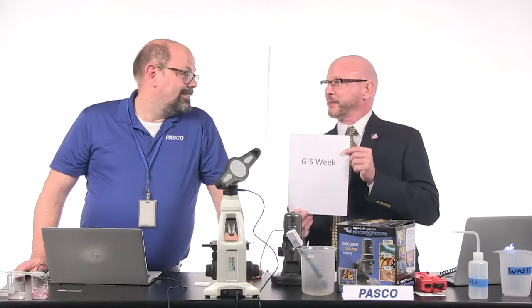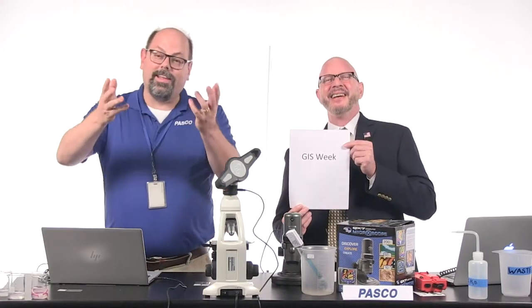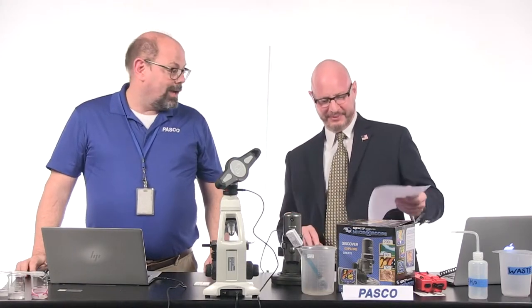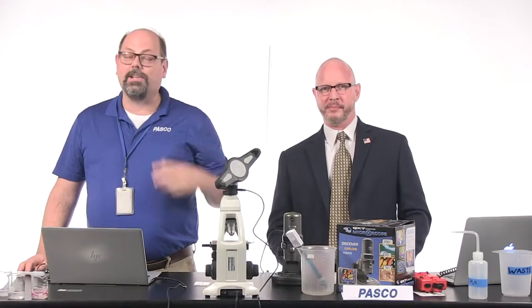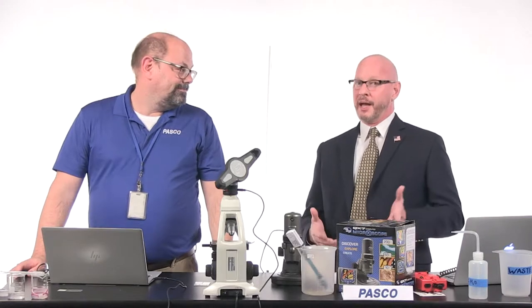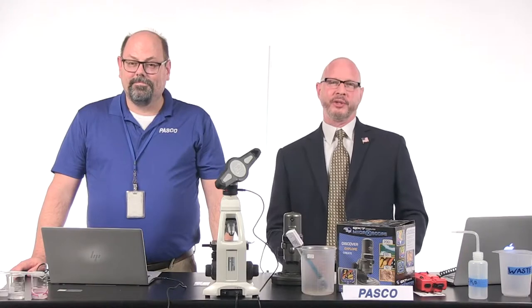I know, I practically can't contain myself. So from the microverse to the macroverse, I think you'll find that our software is going to be a great tool for you to play around with imagery that you capture. And it'll be great for showing images and patterns next week when we measure things out in the field. And we use a GIS and we take a look at actually pulling in our images and connecting it with location, which is what GIS is so good for.